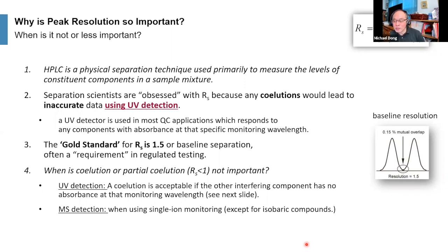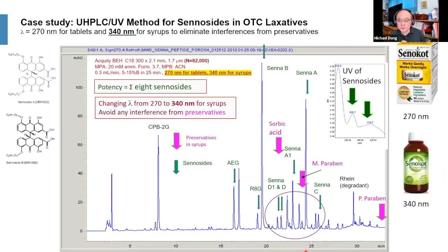So mass spec is definitely great, but mass spec is not really QC compliant. Mass spec is very difficult to have very precise quantification. You really struggle for mass spec to quantify down to 1%, which is not good enough in quality control of drugs for drug substances. We really need a precision less than 0.5%, right? So mass spec is really not acceptable for very precise QC work. So UV detector is still the king, the workhorse in quality control.